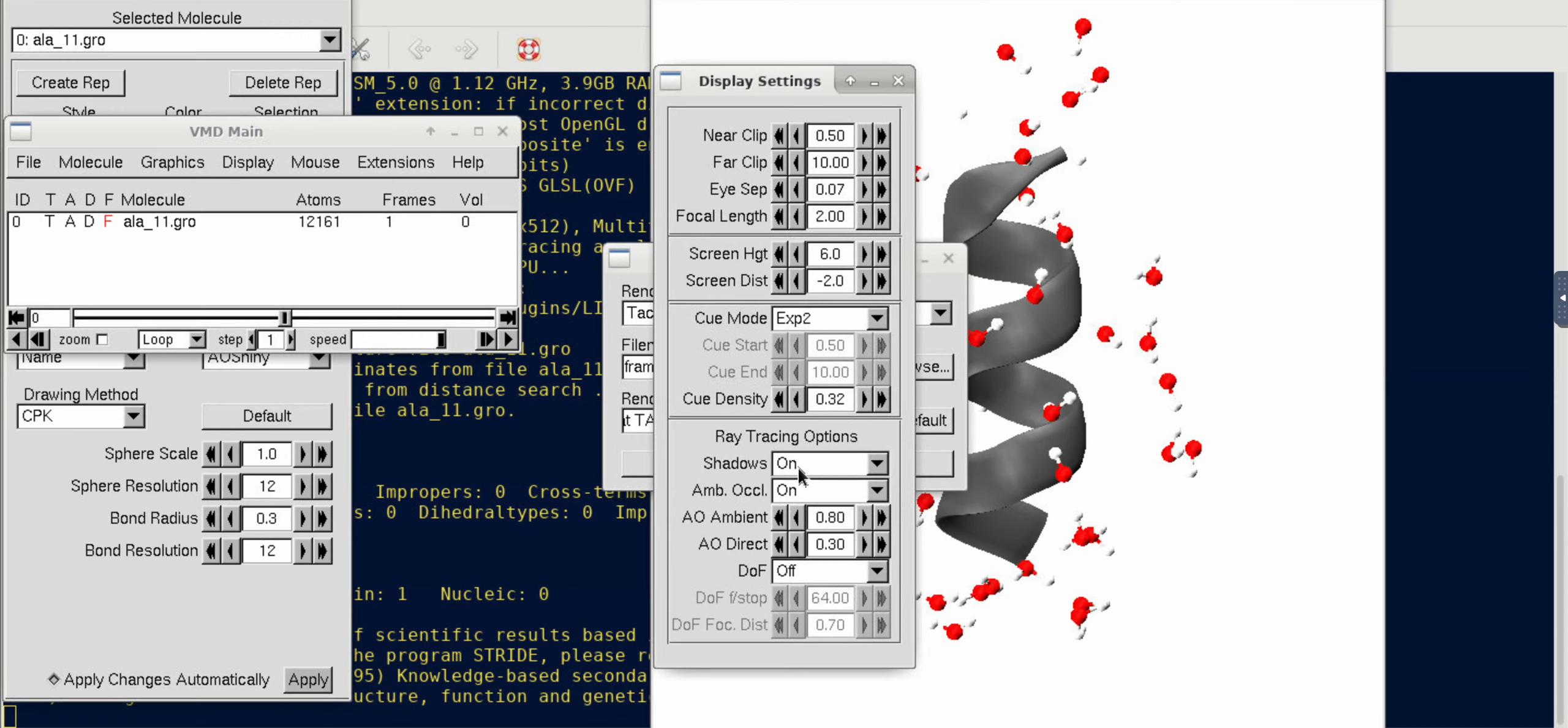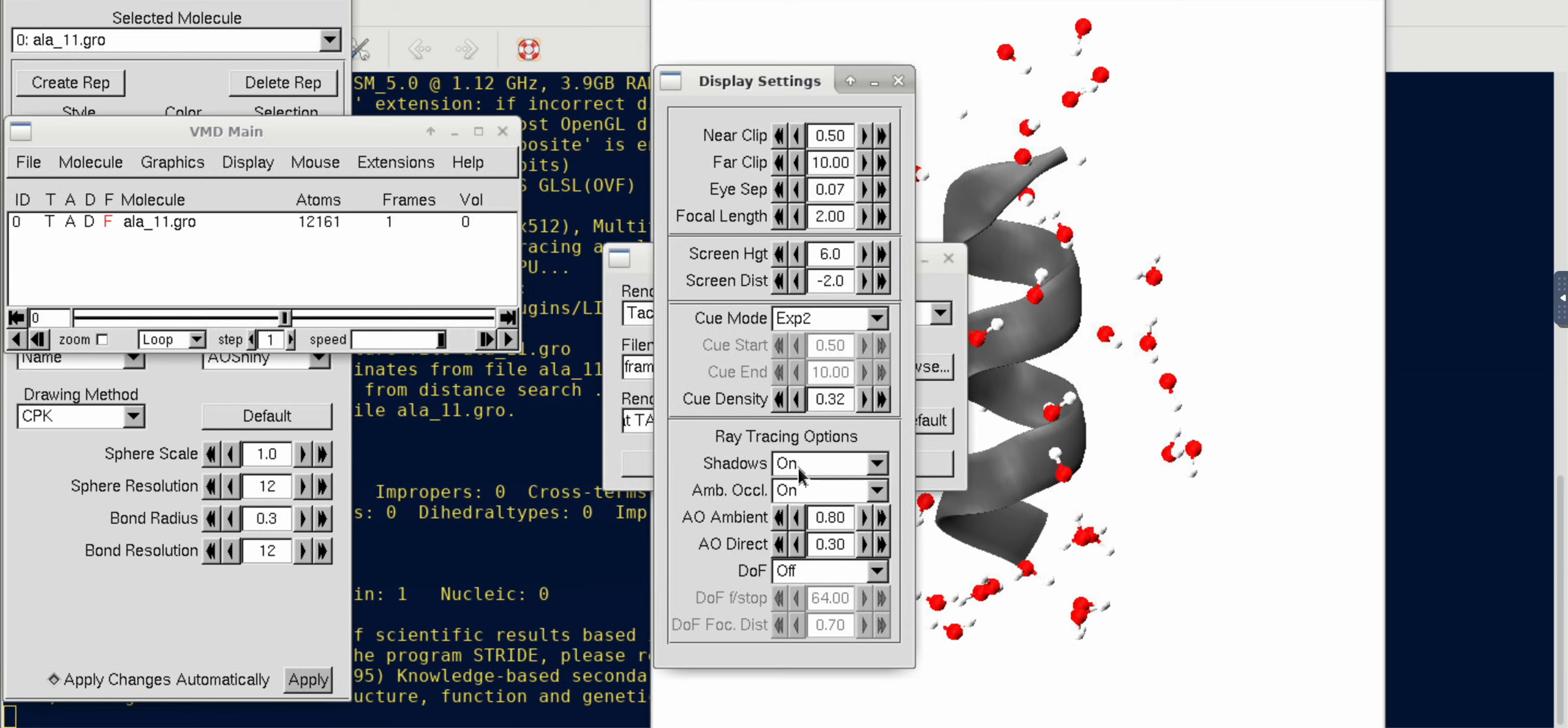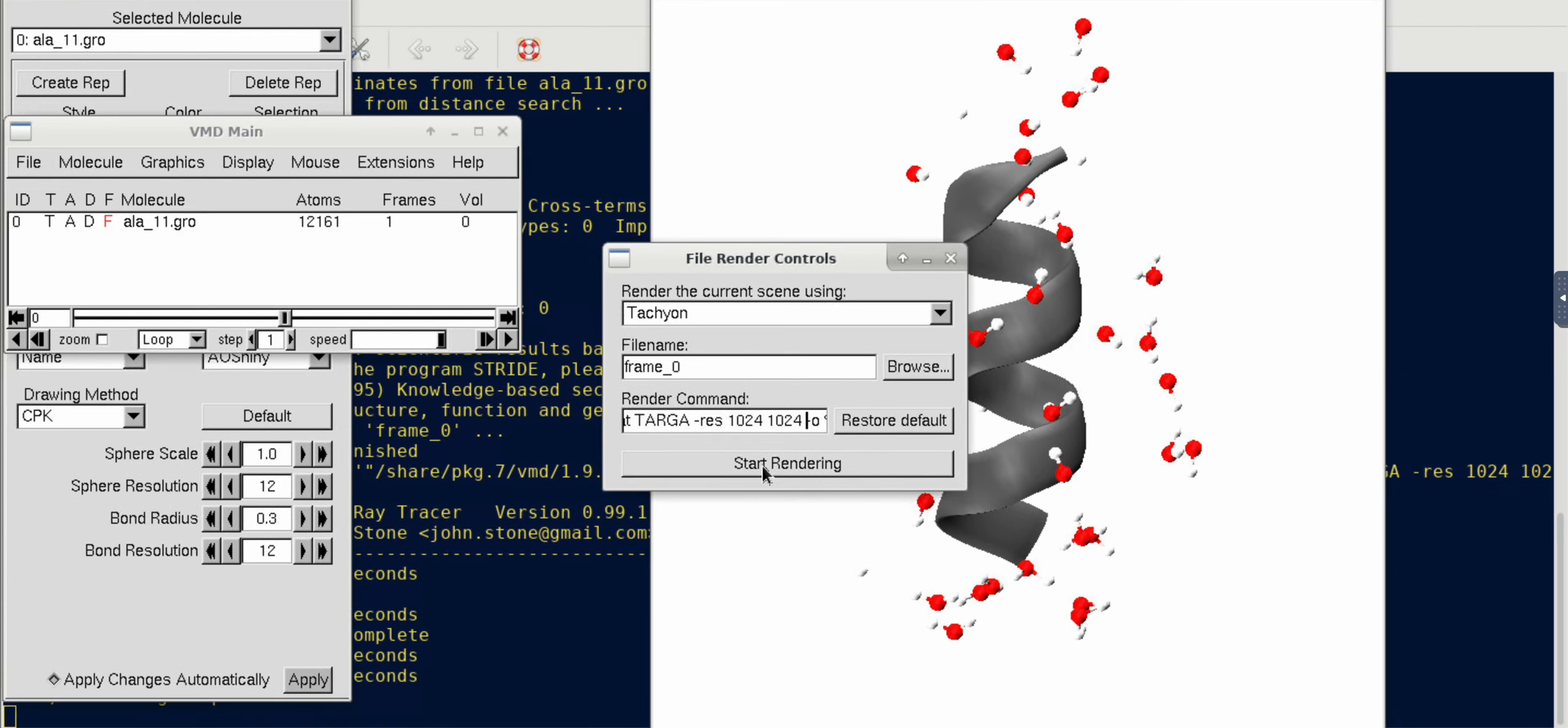Then you have to hit Start Rendering, but before that I would like to ensure that some options in the display options are turned on. For example, if you go to Display Settings you can see there are these two options which are already on in my default setting, but in general they are turned off. So make sure to turn them on and they will give you a more dramatic quality of your image.